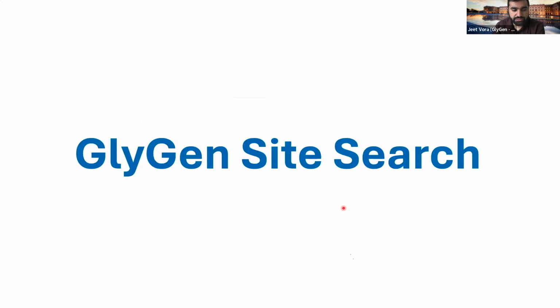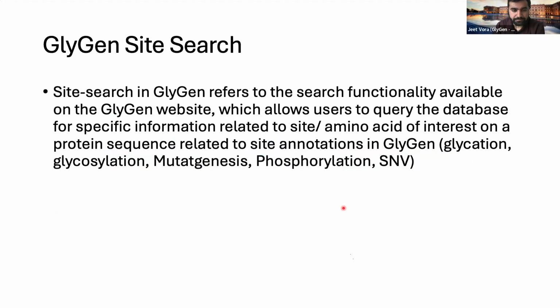Now the last tool, an interesting tool called GlyGen Site Search. I'm going to talk about it, and you can use that, especially if you're in the field of proteomics, glycoproteomics, glycomics. This can be a good tool to be used for further exploration.